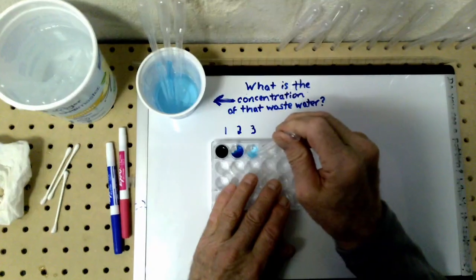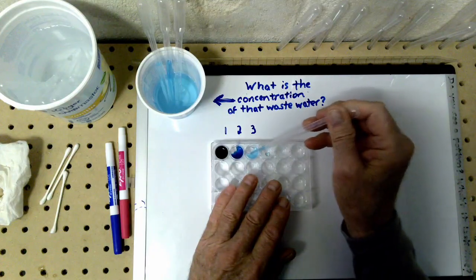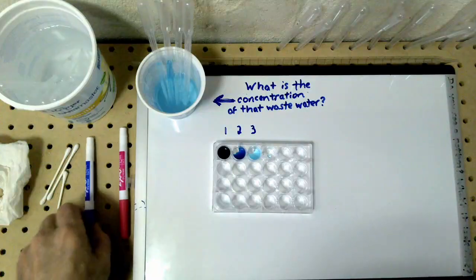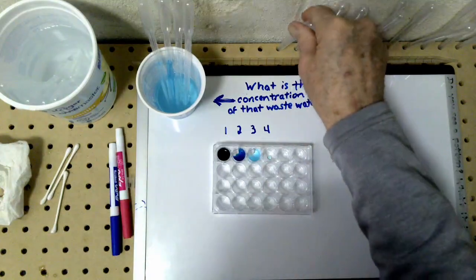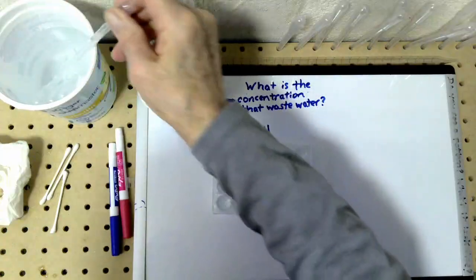Okay. And we take one of those drops and put it right there. That has to be cleaned out. Now this will be times 10 to the 4, ten thousandths. And another pipette. Let's see, where am I at? Okay, I gotta get water now. More water.